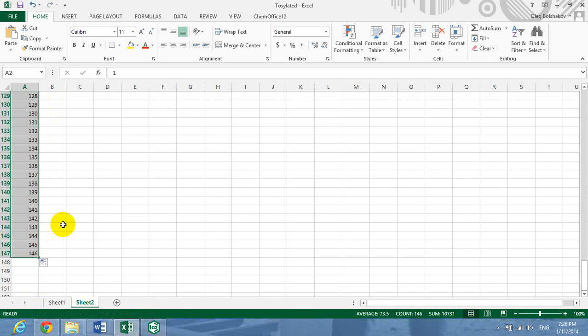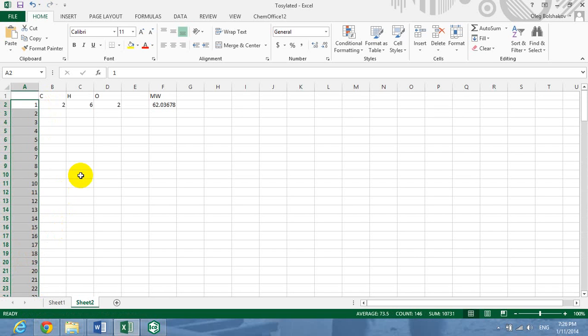We also know that the ethylene oxide polymers comprise ethylene oxide units, and the difference between the ethylene oxide fractions is one ethylene oxide unit. So we are going to add an ethylene oxide unit in this formula.